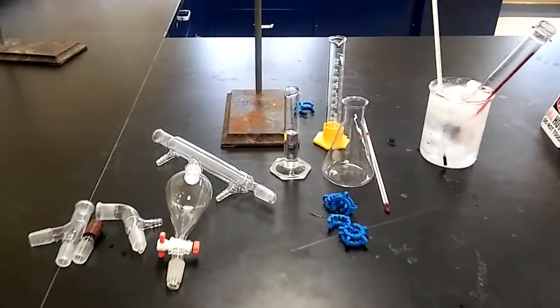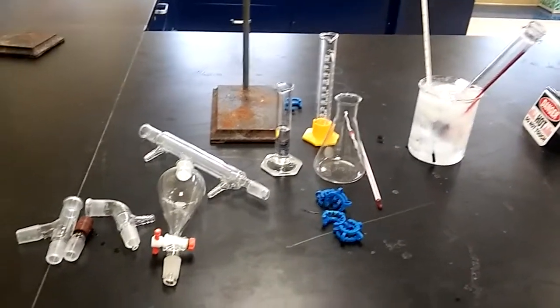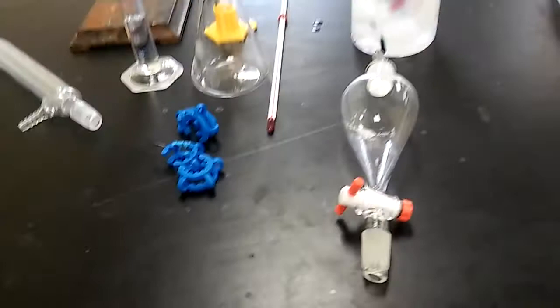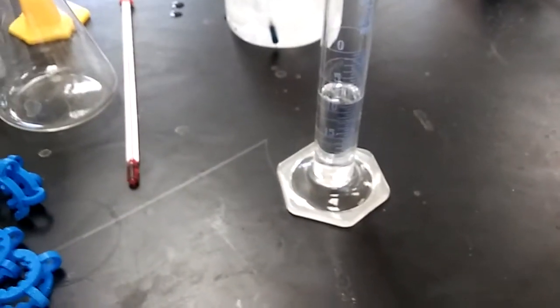Okay, here are the basic supplies you need, and let me walk you through what I have here. So here you have the whole distillation kit over here, and then I'm going to get the round bottom flask when I'm ready, and I've got a separatory funnel because that's the first thing you need. And then here I have 12 milliliters of t-butyl alcohol, or 2-methyl-2-propanol, 12 milliliters there.